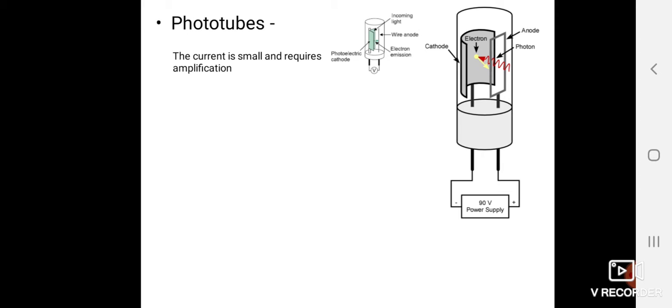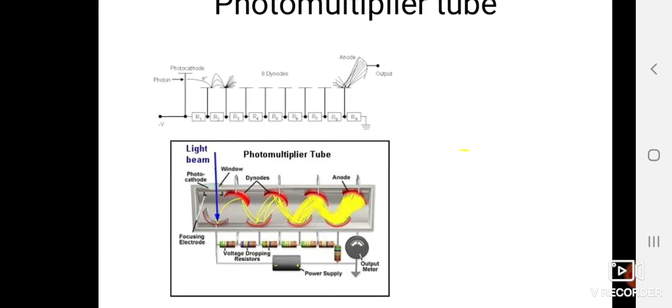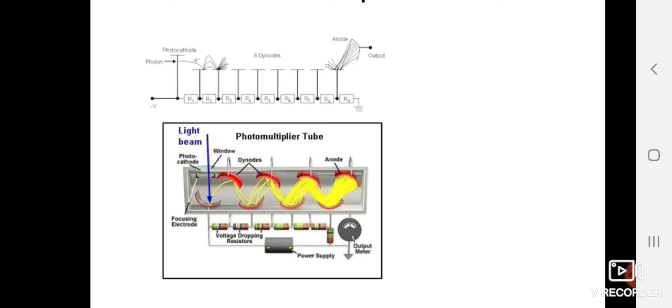And these particular phototubes are being used together in a number of ways in order to give more specificity and to amplify more signal. People are using it multiple times, so that more of it can enhance the signal to a larger extent. You can see down there.